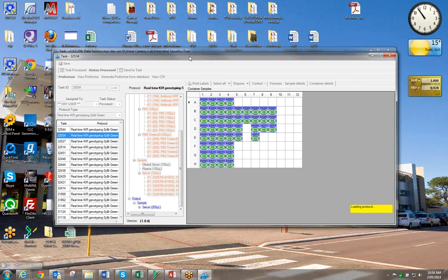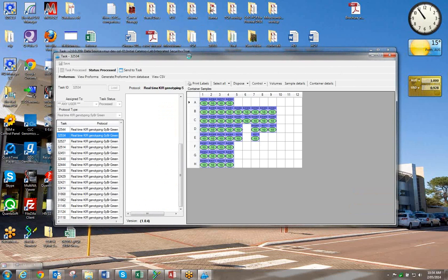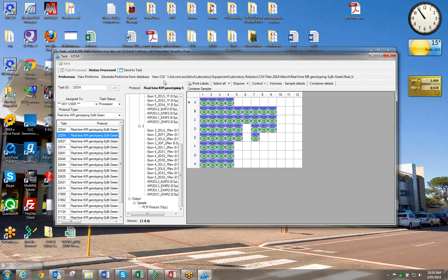I've taken Rama through the CSV file. So that's what the CSV file does, if it's there, it tells you where the directory is. And maybe because it's sharing on GoToMeeting, screen is being shared, that's why. I don't know why it's taking really long to do it. So if I now view the CSV file, I should see it. Because it's going back and forth, maybe that's why, but it's taking ages. Normally it should pop up quite immediately.